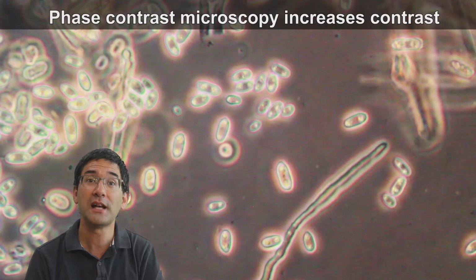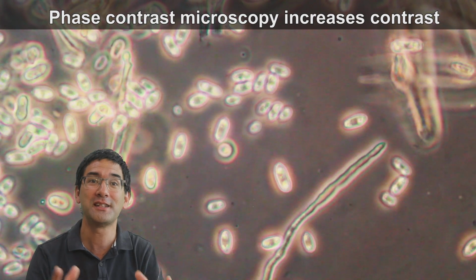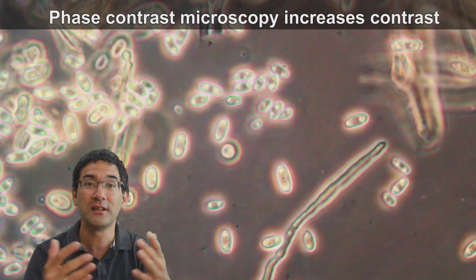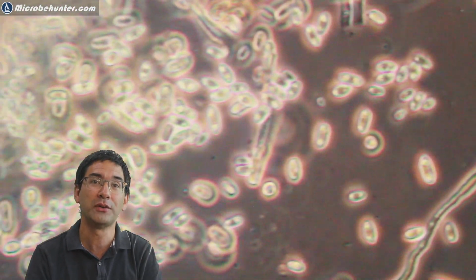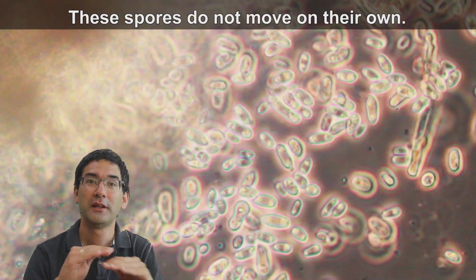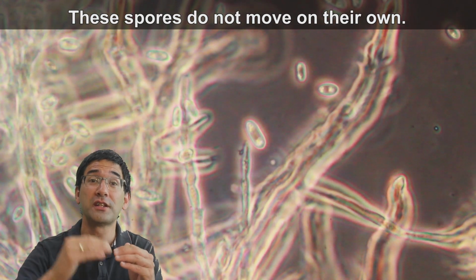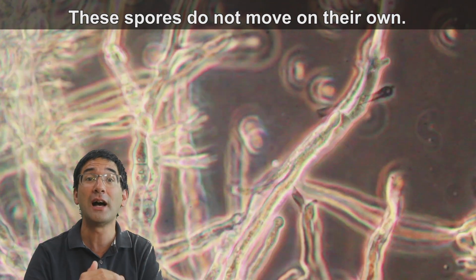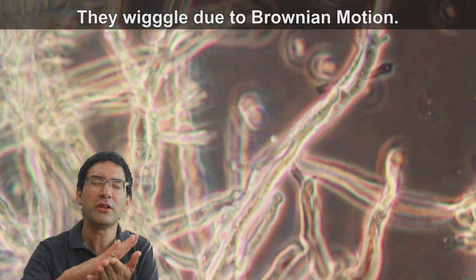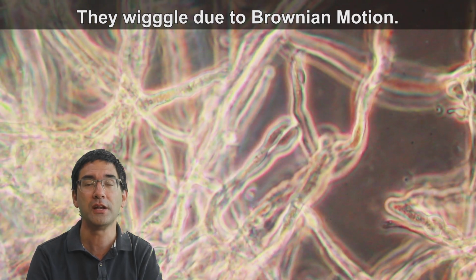So this here, for example, is in phase contrast, and this actually shows now that the spores are very nicely contrasted in relation to the background, and I'm focusing back and forth to actually show you that yeah, the spores can be quite small, because as soon as I focus away, immediately it goes out of focus. So the spores are very tiny, extremely small, and can spread very easily over the air.